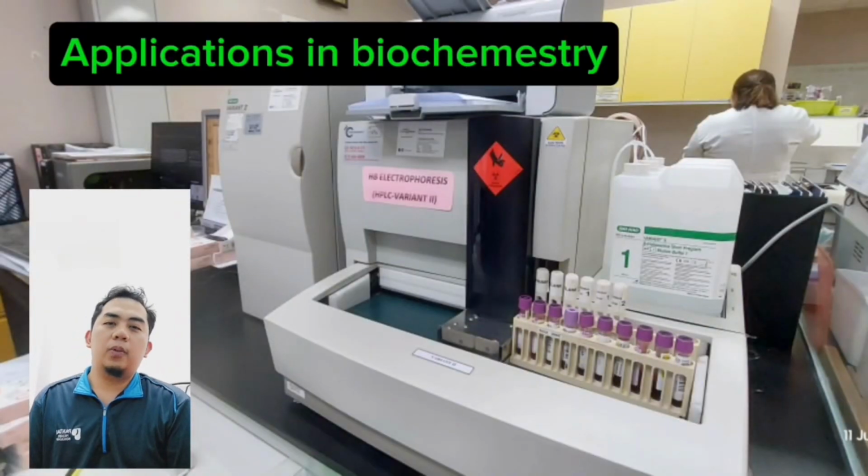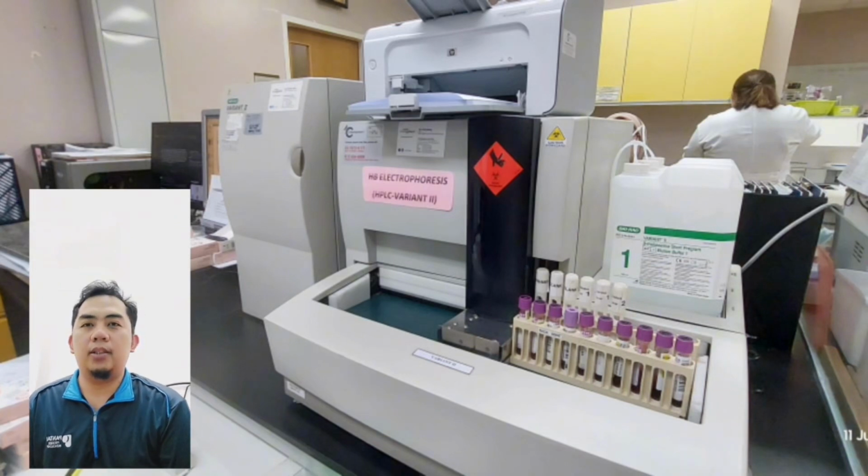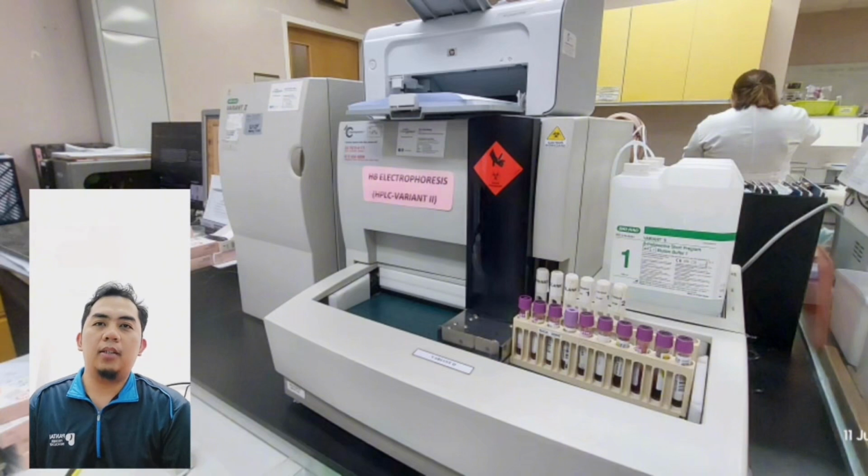Now, we go to applications in biochemistry. So, how is HPLC actually used in real life? In biochemistry, HPLC is used to analyze amino acids, separate proteins, and verify the purity of compounds in drug development. For example, in pharmaceutical labs, HPLC is used to ensure the exact amount of active ingredient in a drug is present, which is crucial for patient safety.